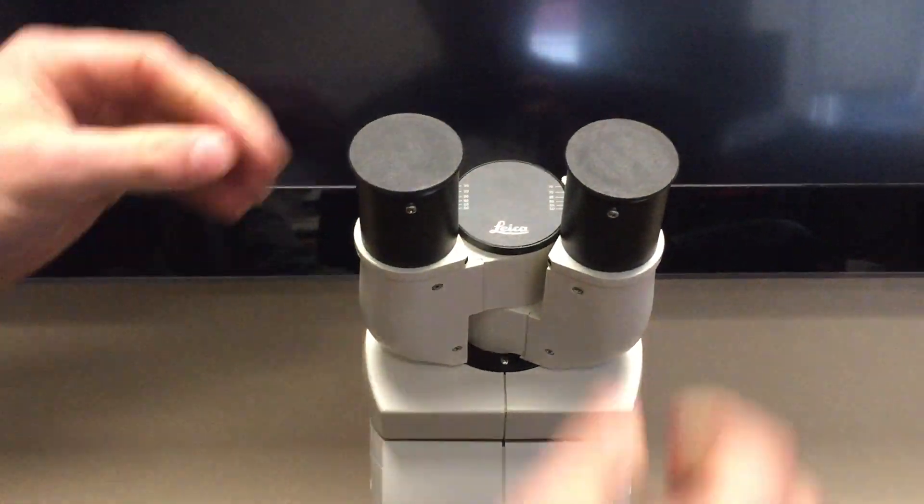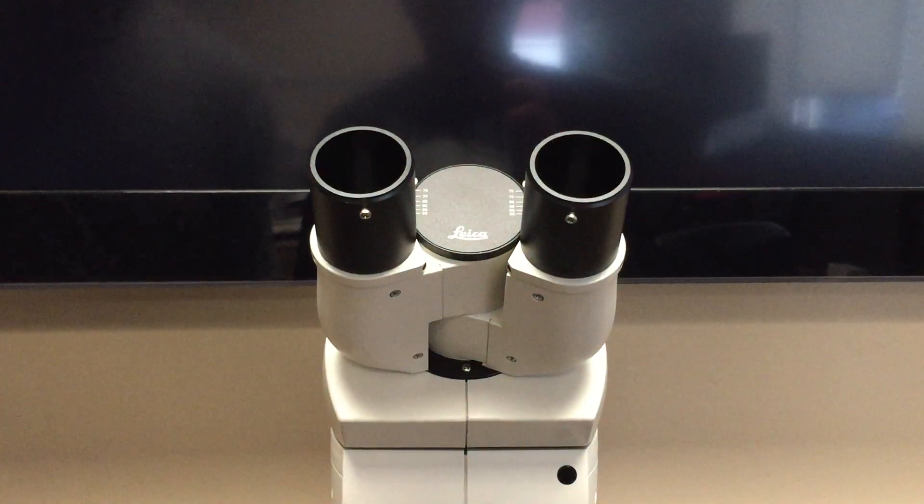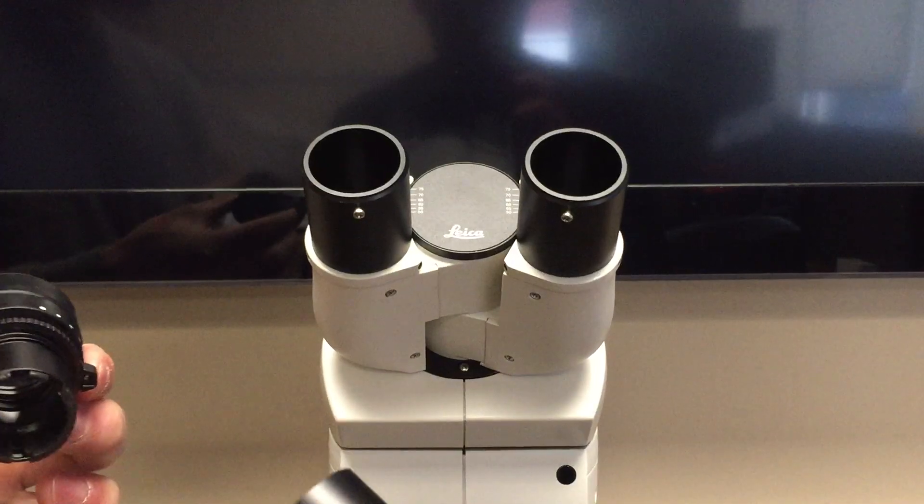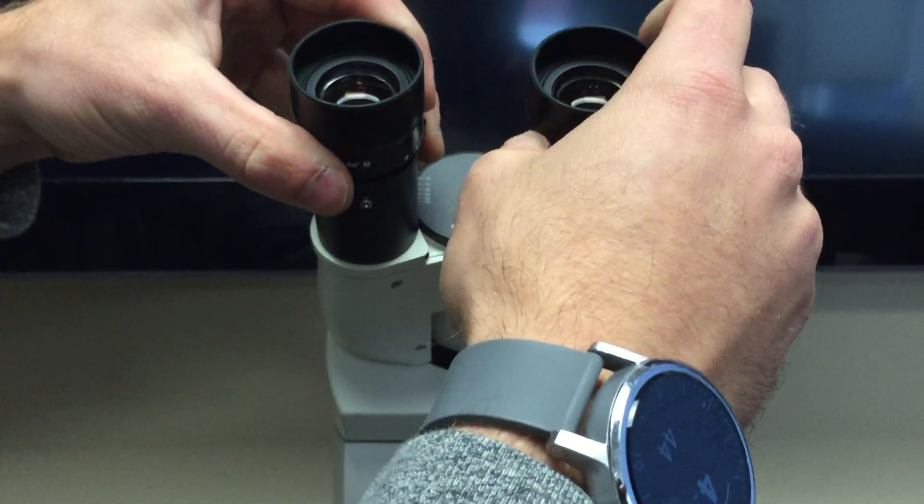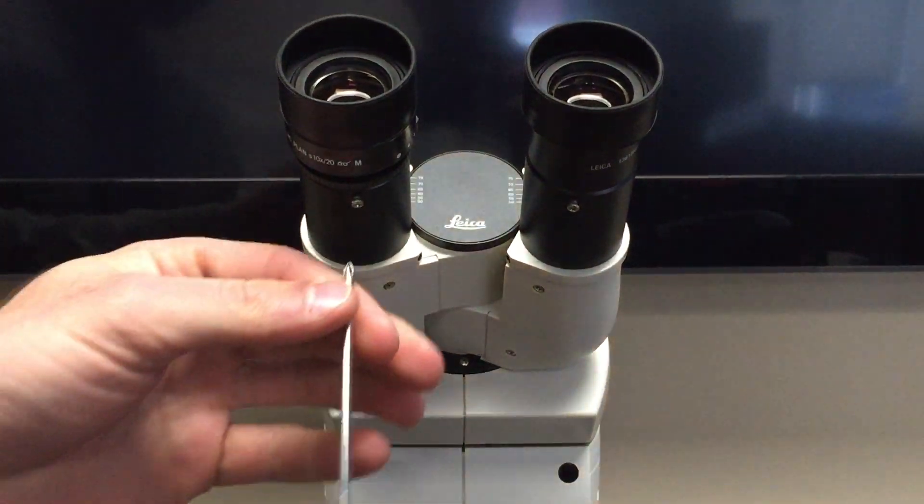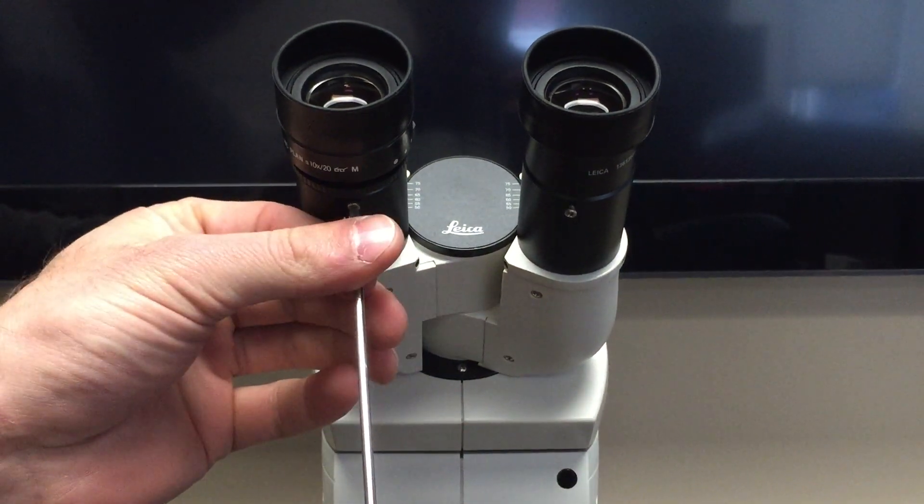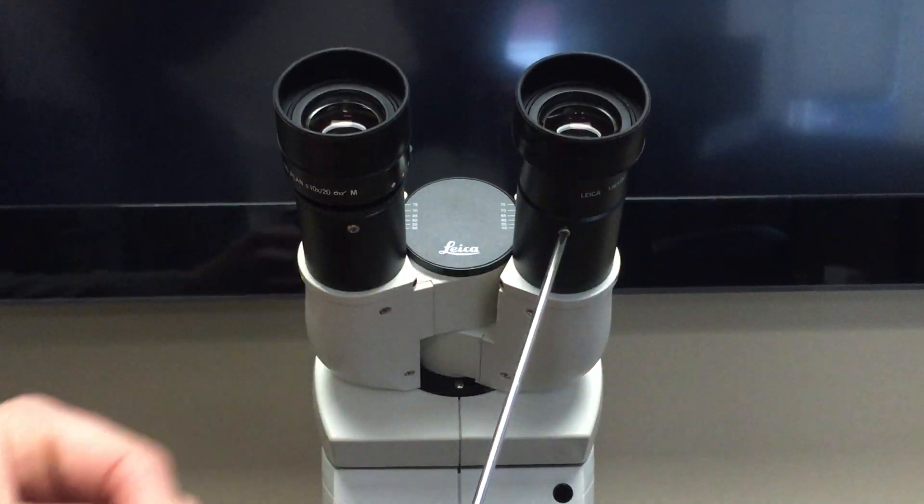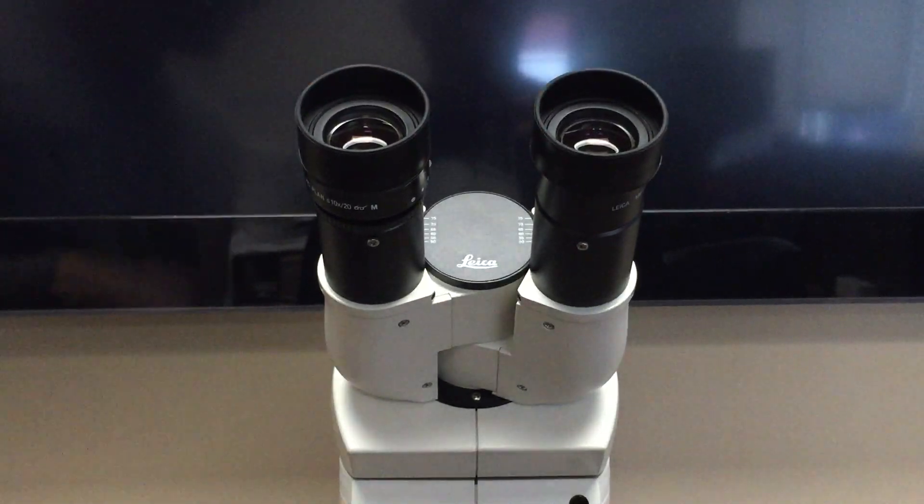Remove the two caps over the eye tubes, grab your two eyepieces, and insert them in the eye tubes. Using the screwdriver, tighten down the lock screws, and now your eyepieces are set and locked in place.